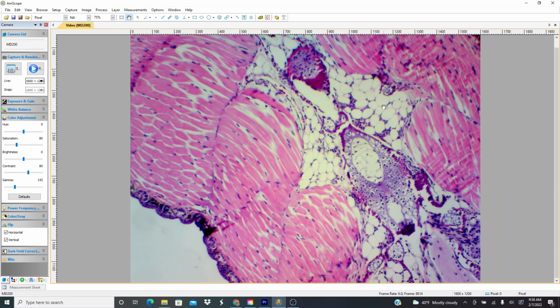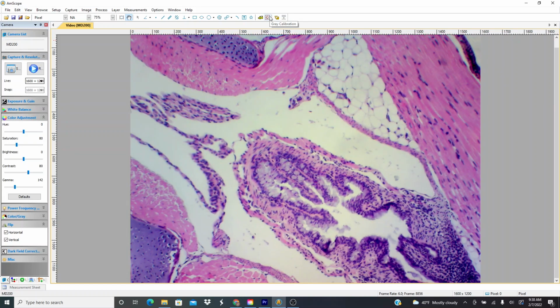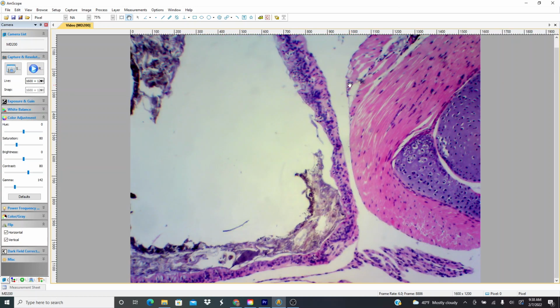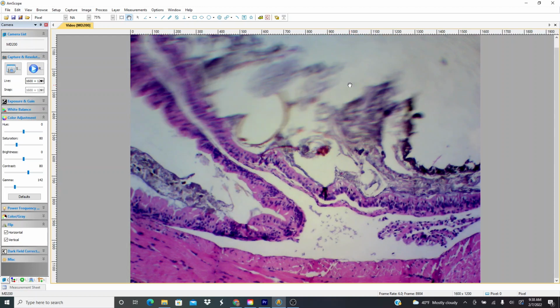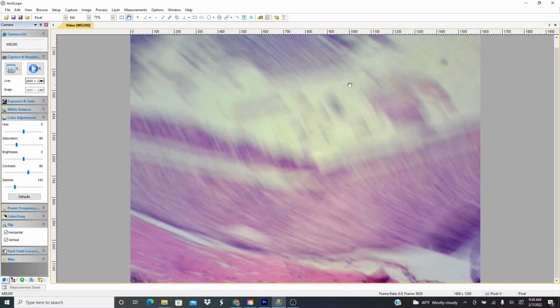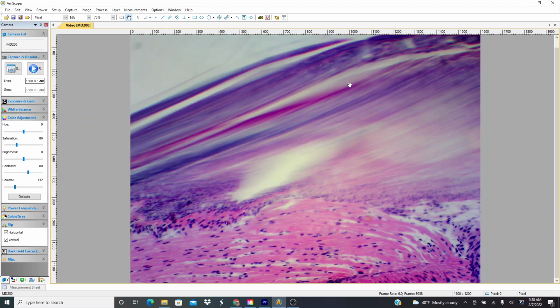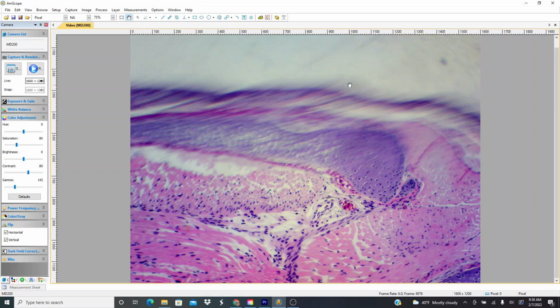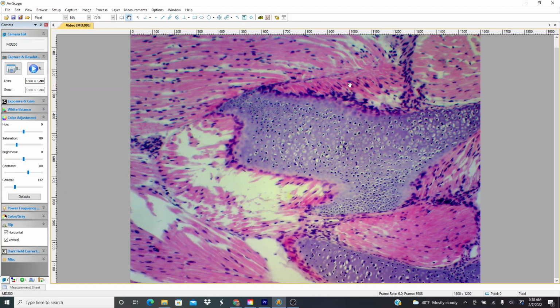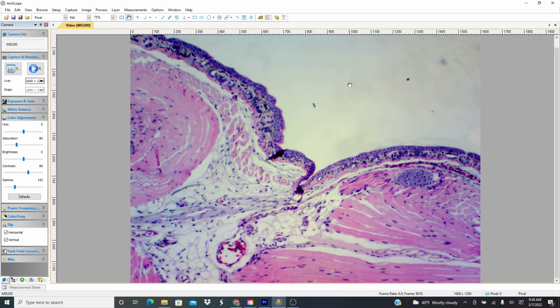This tissue here, this sort of white tissue, that's fat. Adipose tissue. We don't see much of it in this guy. There's some more of it there. This is pretty cool. Yeah, back into the gut. Let's go back this way. Yeah, I was hoping to see something like a brain. I guess this cartilage in the head is jaw material or something like that. Or I don't really see anything that looks like a skull.